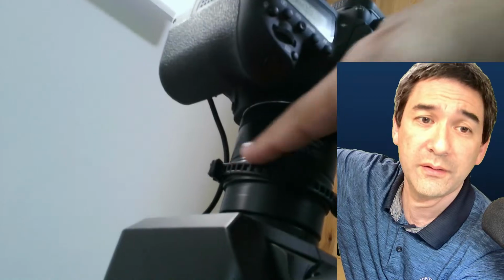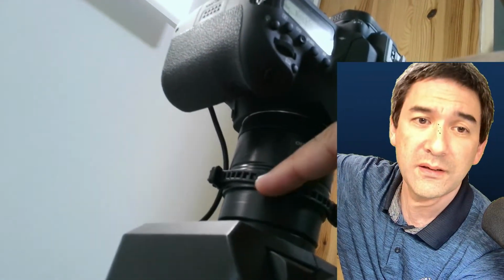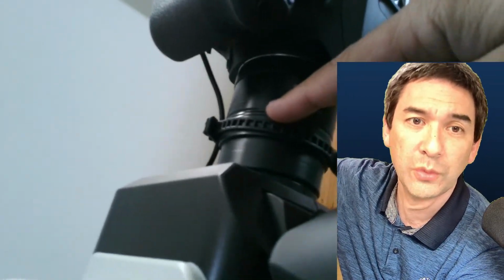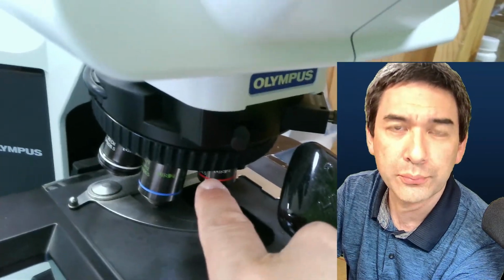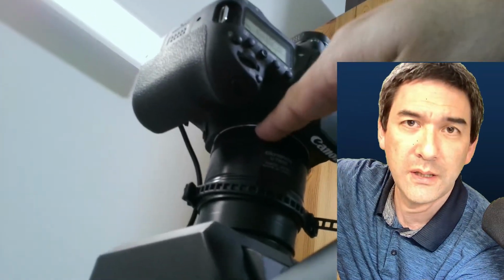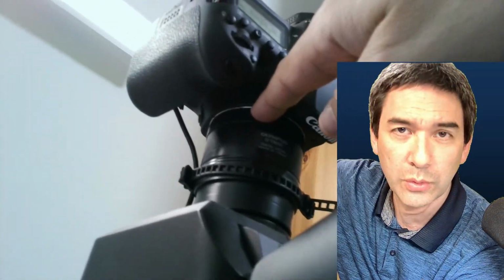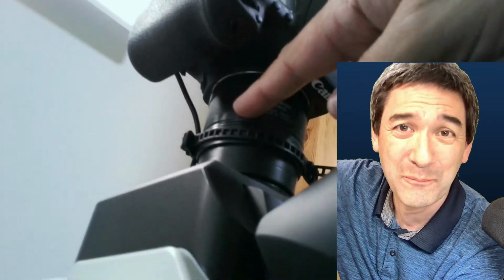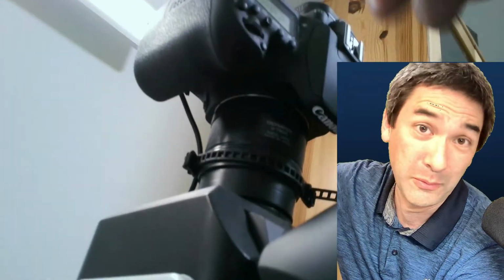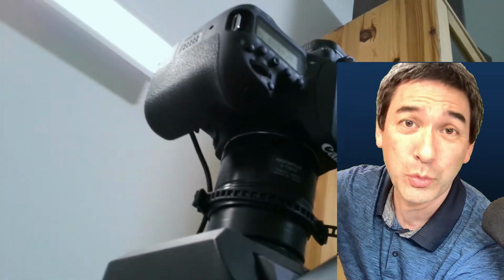I would like to talk a little bit about this because the setup, as you can see, is quite wide here, but still there are no optics in here, no lenses, because the objectives down here directly produce an image onto the camera sensor up here. Because of that, this has the really cool advantage that there are no optics in between which could degrade the image quality. So it's probably one of the theoretically best image qualities that you can get.